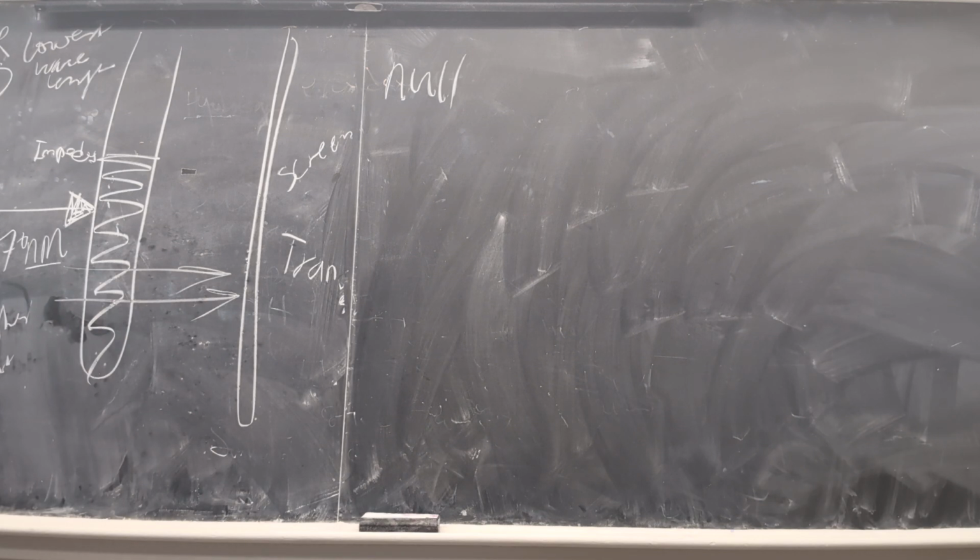You guys started? Okay, alright. So what do you have on your test tube? How many different fields do you have? Make sure that you take 4 test tubes. 4, not 3. I'm sorry. 4, not 3. So one more.